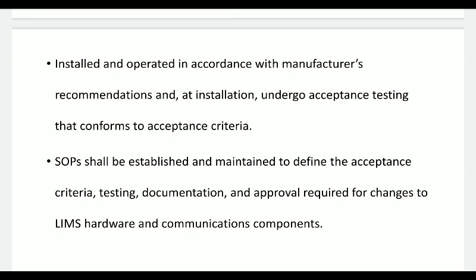How you are testing your hardware, you have to document. And suppose you want to make some changes, remember change control. Suppose you find that your hardware is not working properly and there is an urgent need to make some changes, then you are supposed to follow a proper procedure. Whatever changes you are making should be documented properly, and you must have authorization to make those changes, and post changes you have to get approval.